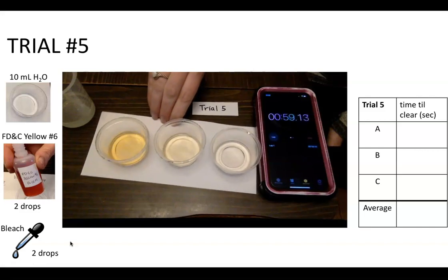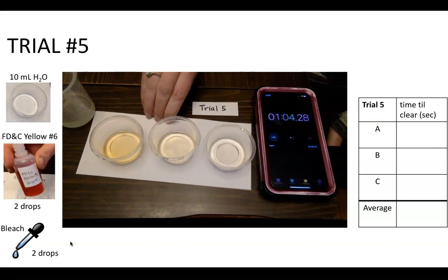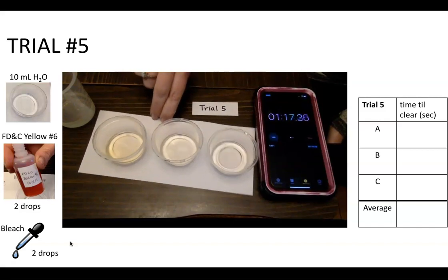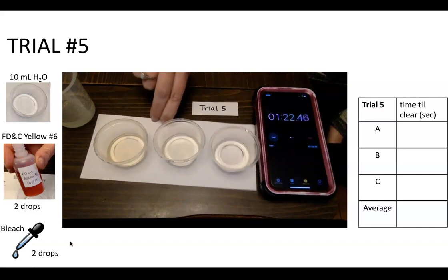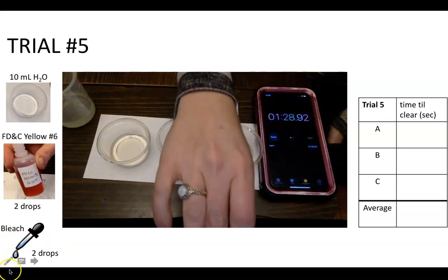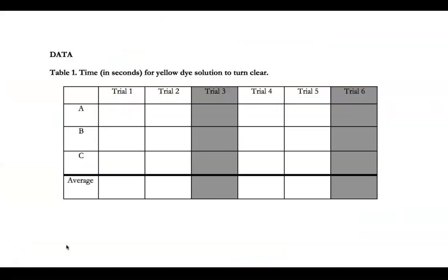That one went. And I called the middle one. And call that first one. In trial 6, we said we're going to ignore this one.